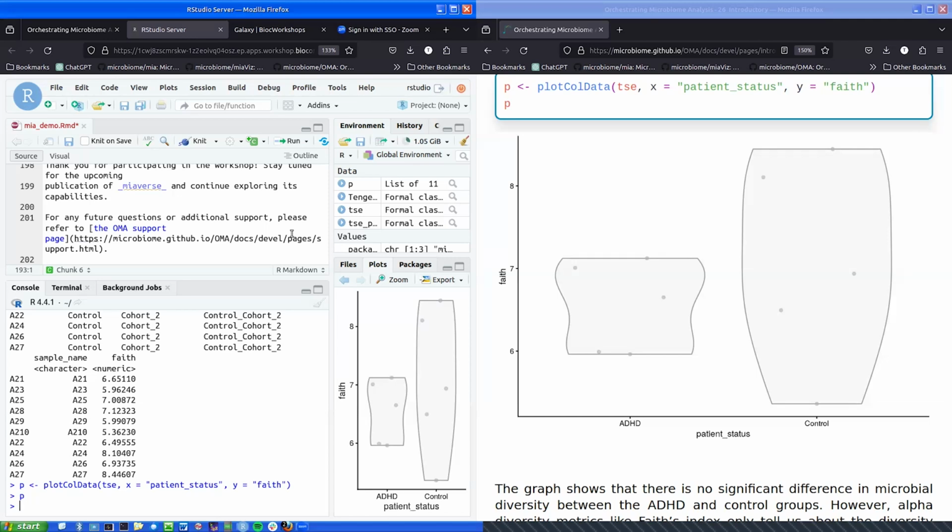Maybe one point that Tuomas didn't highlight many times, at least, is the interoperability with metabolomics, proteomics, and cells.